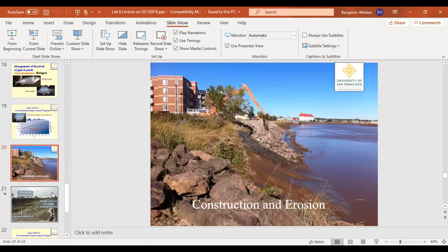Well, this is going to be important for the second part, which is turbidity. There are no real slides for turbidity, so I'll go over it now. Turbidity is another important water quality parameter. It is basically, in simple terms, how clear your water is. If you have a higher turbidity, or it's more turbid, it's going to be very cloudy.